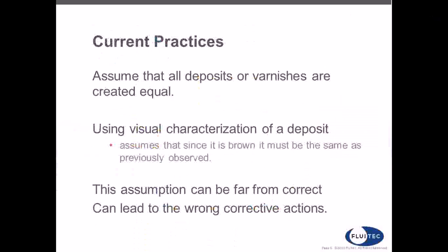And so one of the recurring themes you may hear today is that it's easy to make assumptions, and it's natural for us all to make assumptions based on our previous experiences. Certainly that influences how we see things in the present, but often these assumptions are wrong. So we try to encourage you to try not to assume, and have analytical data point the direction as to what may be causing these problems.